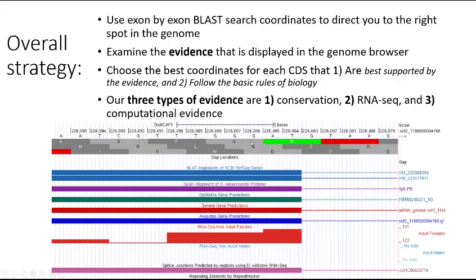And so here we're coming to the end of an exon, and you see here that RNA peaks drop down, and also there's a predicted splice site right at this location. You see that this is followed by a G and a T, which are the consensus splice donor sites, and therefore the very last base of this particular coding exon is likely this T here, and we would record that exact number. At this point, we would also check the phase of that particular exon-intron boundary. And we would repeat this for all of the splice donor and splice acceptor sites for the entire gene.